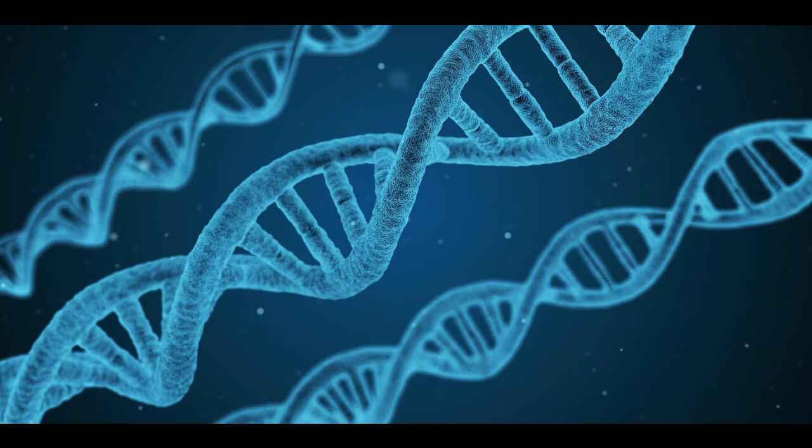I'm happy to take that. First of all, it differs quite a bit. For Cortinarius, for example, I would want there to be no more than maybe two base pair difference or half a percentage point of difference, because the species are very close together in genera like Cortinarius. With other species, that's not quite the case. When does it become a species complex? Probably below 99%, maybe around 98% or so, but I'd love to hear, Megan, you probably have a more informed perspective on how to delineate. I think it's more of an art than a science, is my impression.